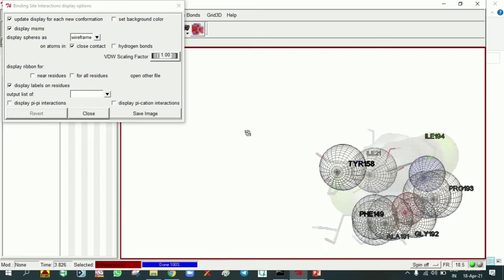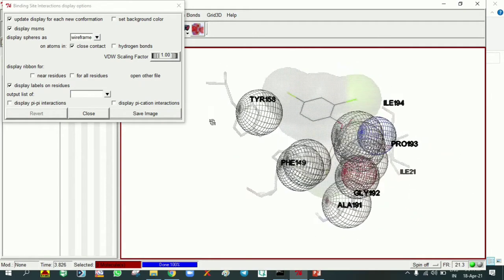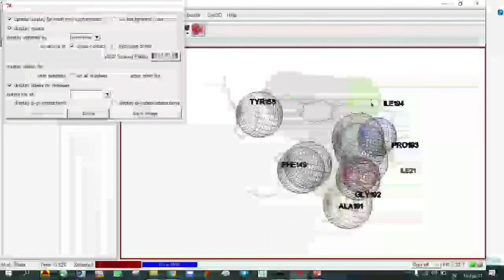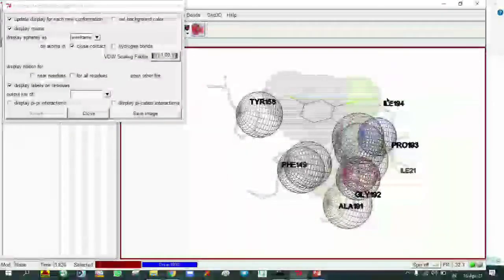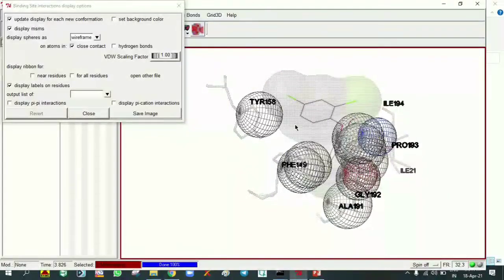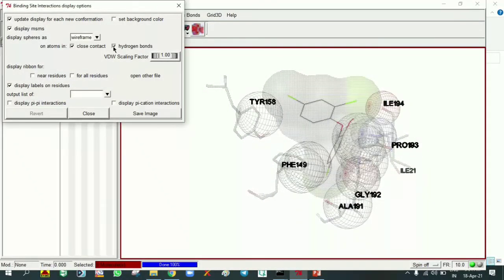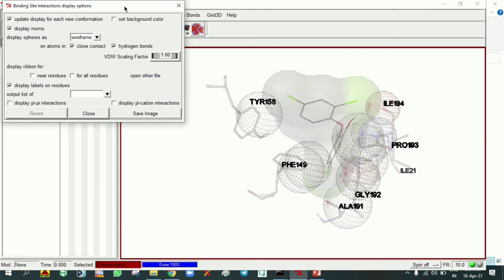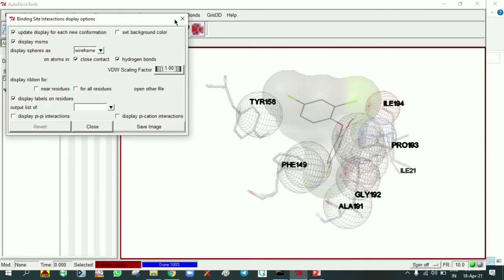You can see here isoleucine 194 is making a hydrogen bonding interaction. Green color is representing it. In this form we can view the result in AutoDock. For the best view, we can see in Discovery Studio. We can easily find the good interactions, how many interactions are formed in Discovery Studio.